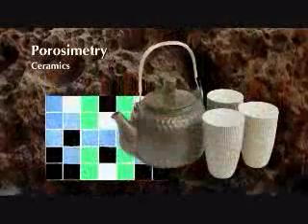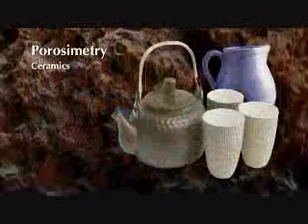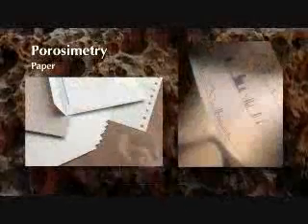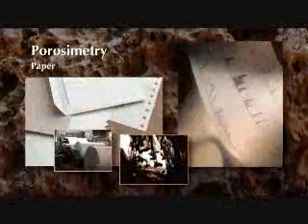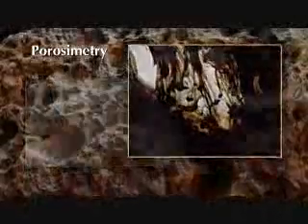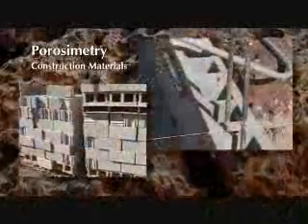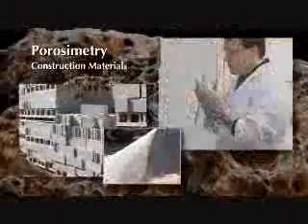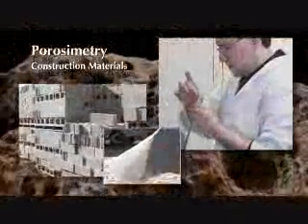Pore area and porosity affect the curing and bonding of greenware and influence strength, texture, appearance, and density of finished goods. Porosity of print media coating is important in offset printing, where it affects blistering, ink receptivity, and ink holdout. Diffusion, permeability, and capillary flow play important roles in the degradation processes in concrete, cement, and other construction materials.